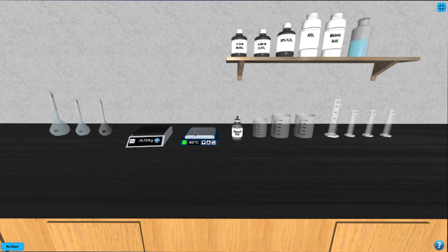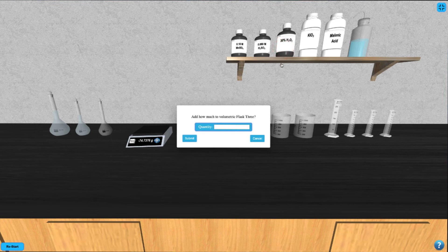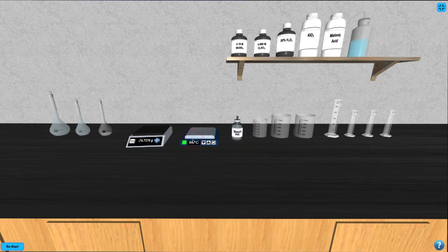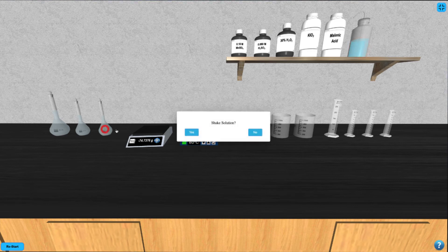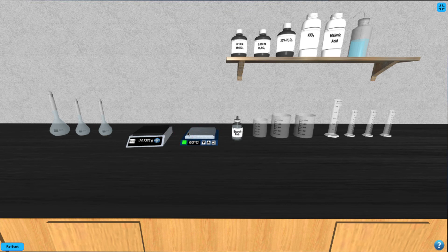To prepare the final solution, solution C, click on the hydrogen peroxide bottle and enter the volume of hydrogen peroxide you wish to add into the third volumetric flask in units of milliliters. Next, fill the rest of the flask with deionized water by clicking on the deionized water bottle, and then shake the flask again by clicking on it.